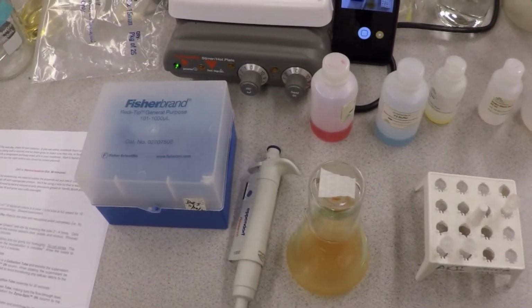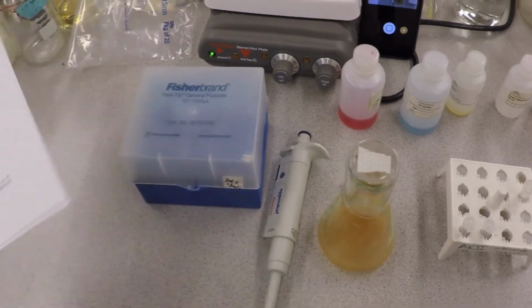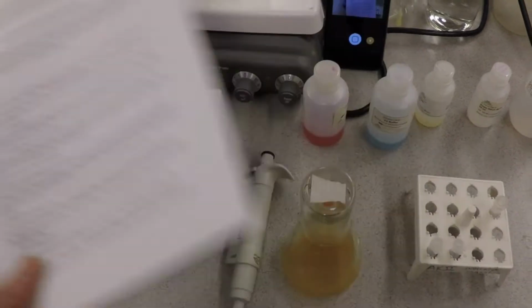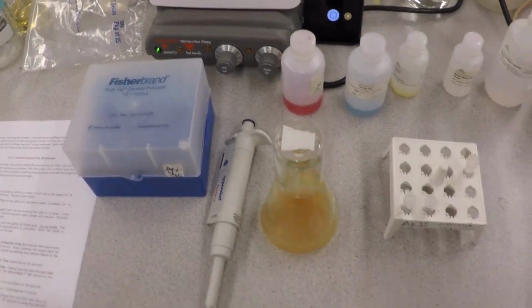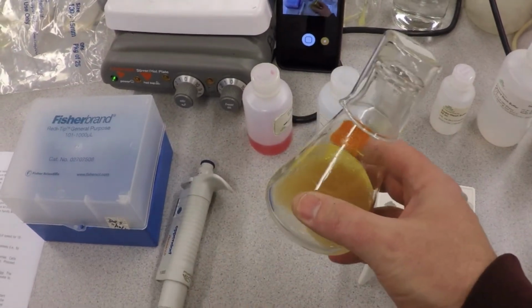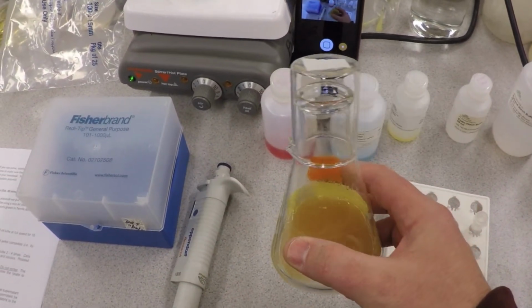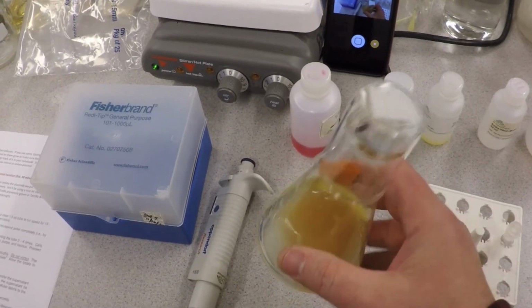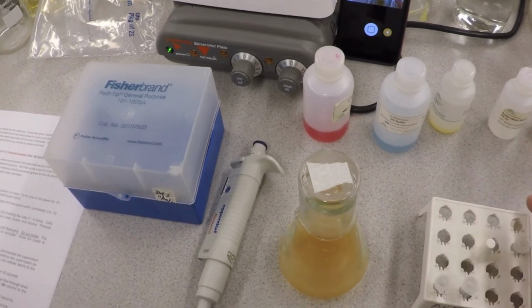I'm going to show you how to do a plasmid mini prep. You will be given directions that look just like this, and everything we need will be given to you in Eppendorf tubes. But here's our culture. This is our culture of P. mycomar. So it's an E. coli that has P. mycomar, the plasmid, in it, as we discussed in class.